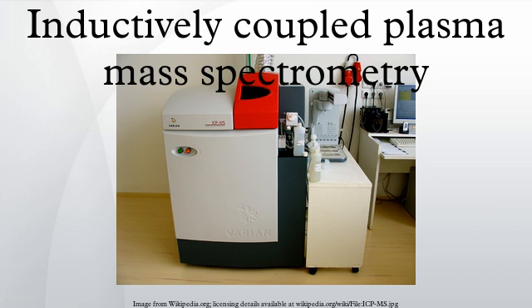Collision reaction cell and CRI. The collision reaction cell is used to remove interfering ions through ion-neutral reactions. Collision reaction cells are known under several trade names. The dynamic reaction cell was introduced by Perkin-Elmer on their Elan DRC instrument and is located before the quadrupole in the ICP-MS device. The chamber has a quadrupole and can be filled up with reaction gases, one gas type at a time or a mixture of two of them, which reacts with the introduced sample, eliminating some of the interference.